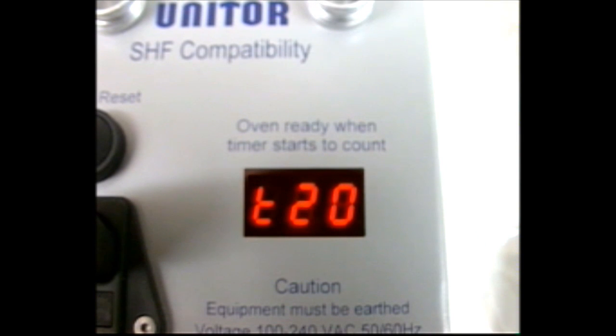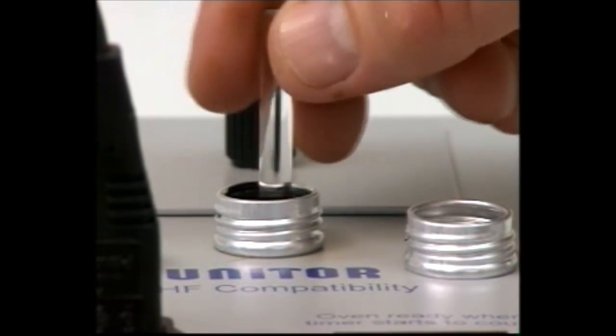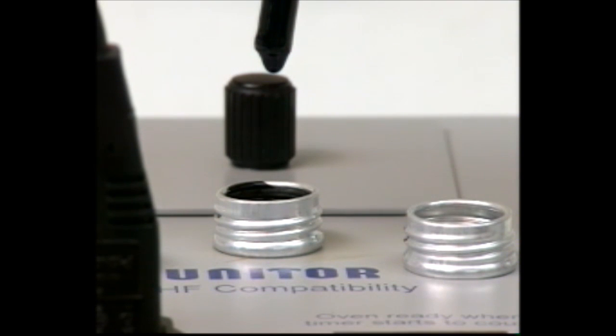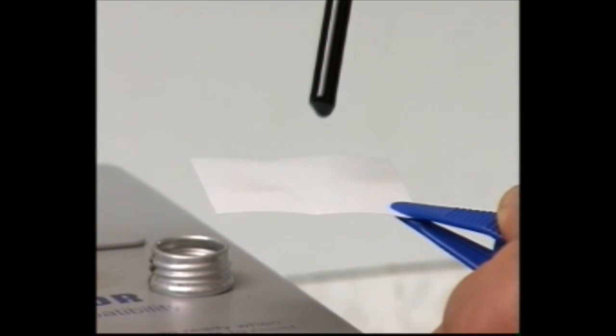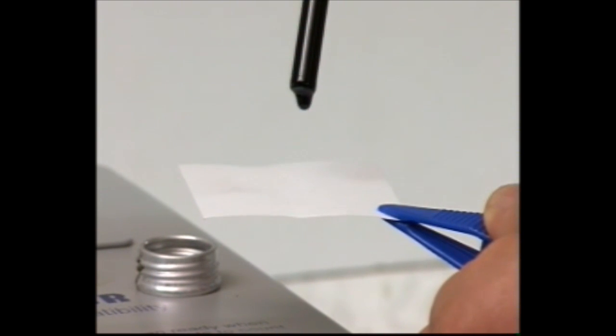Have some test paper ready. Stir the oil with the rod provided for five seconds, then remove it without touching the sides of the sample tube. Let the first drop fall back into the tube and direct the second drop so that it falls onto the center of the test paper.